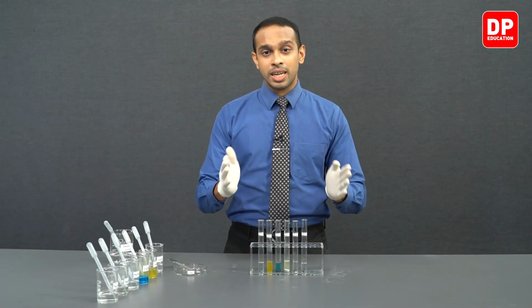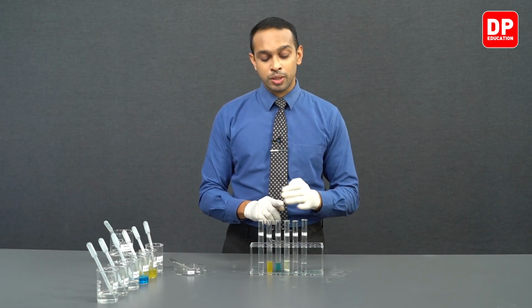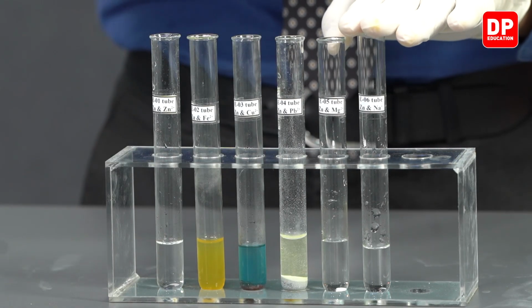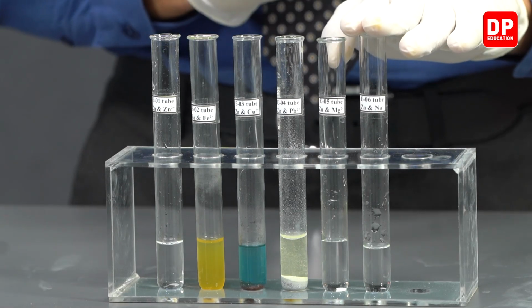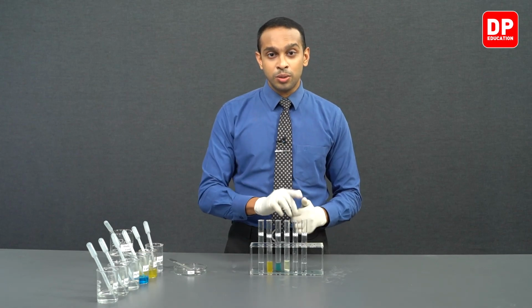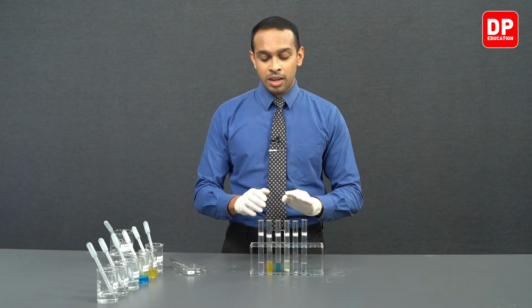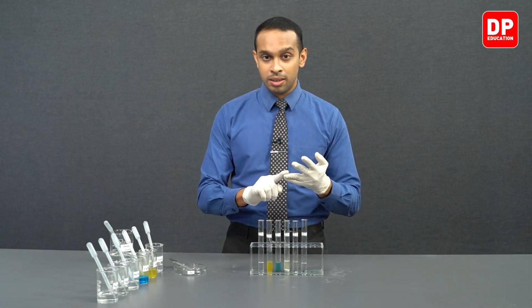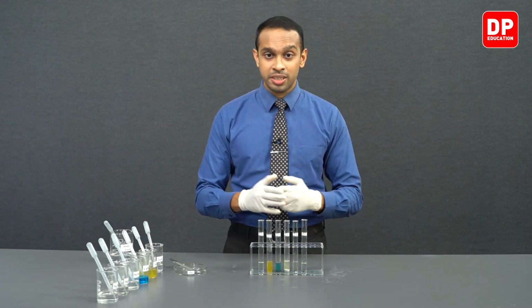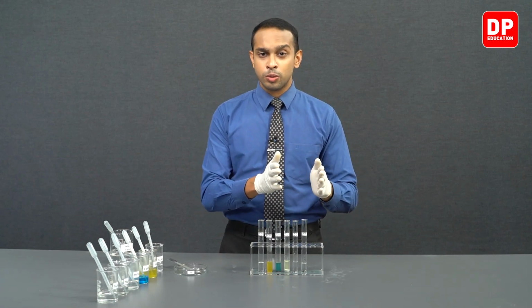So the most reactive metal that we observed in this setup was sodium, because sodium 1 plus aqueous ions did not get displaced by any of the metals we added to it, indicating sodium was more reactive than any of the metals that we added to these solutions today. So sodium is the most reactive. Out of the metals that we have, sodium, magnesium, zinc, iron, lead, copper, sodium was the most reactive, copper was the least reactive. So after sodium, which metal was most reactive?